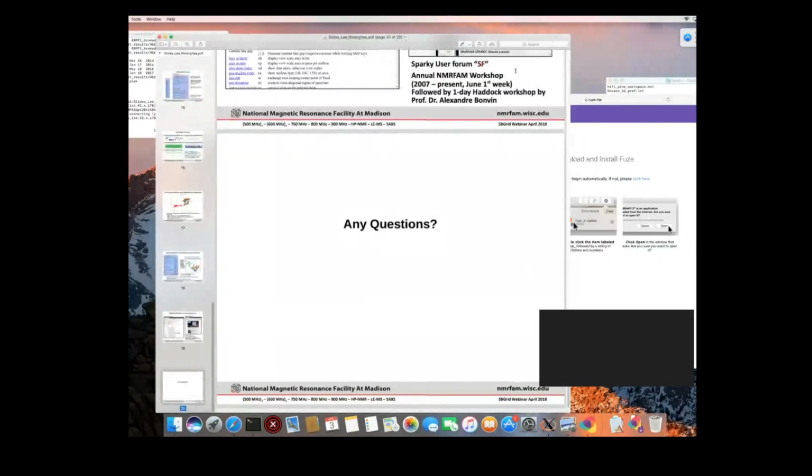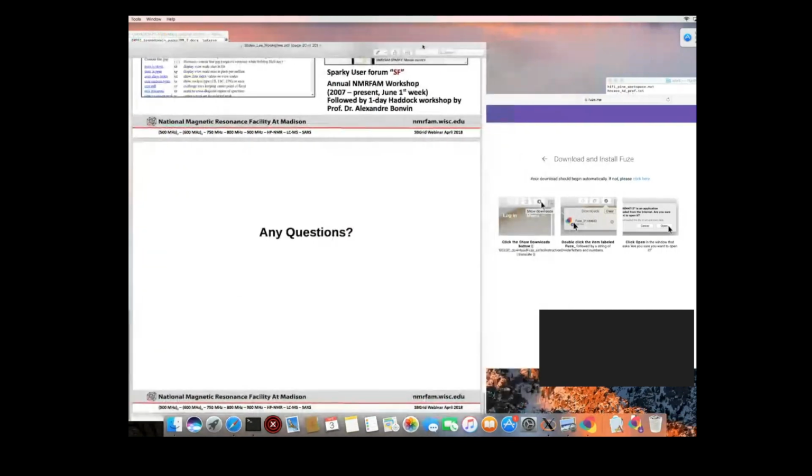It's great to see so many features that can improve and enhance the progress of assignment. And I think anyone who's gone through and done a manual assignment can appreciate that having a quick key for every possible display and every option can really speed up your workflow. You can almost get into a place where your hands know the quick keys before your brain does, and you can sort of navigate through your spectra really seamlessly.